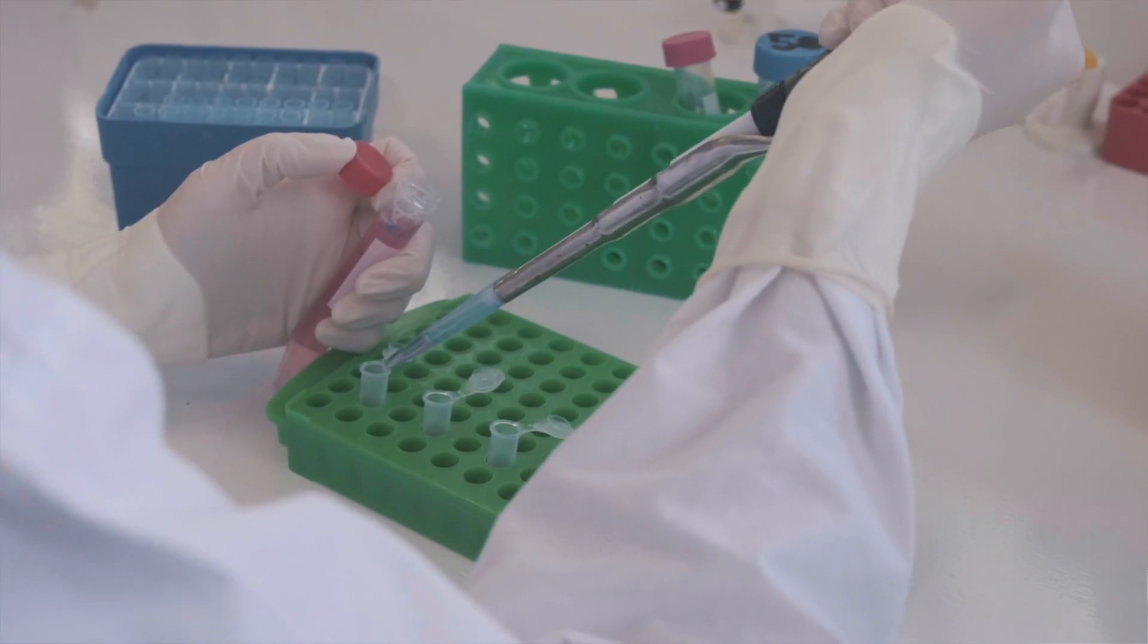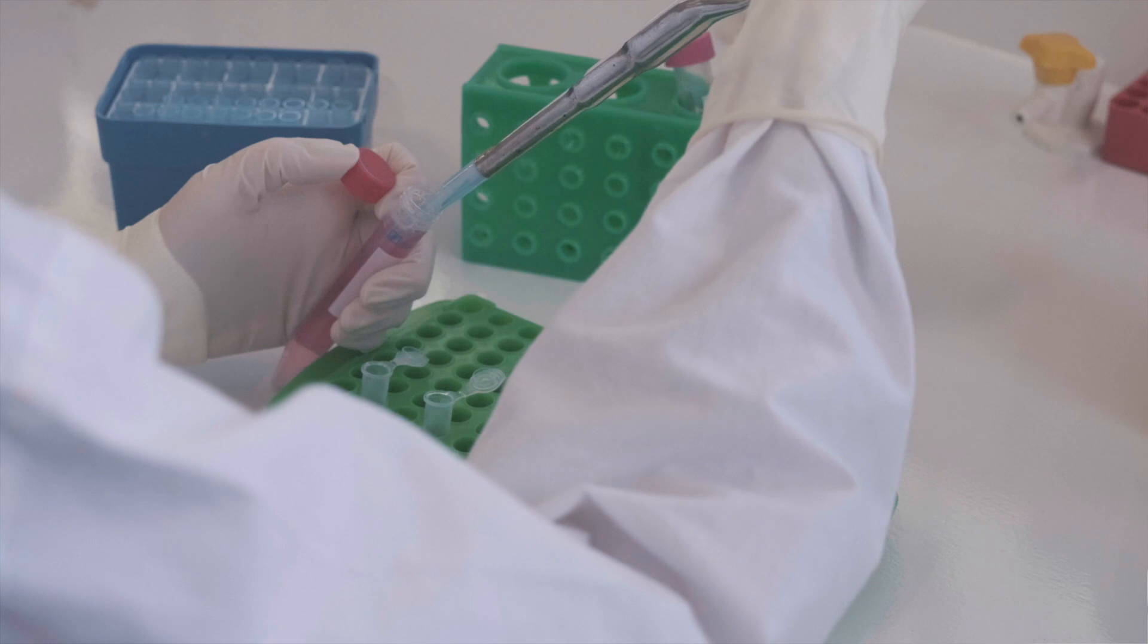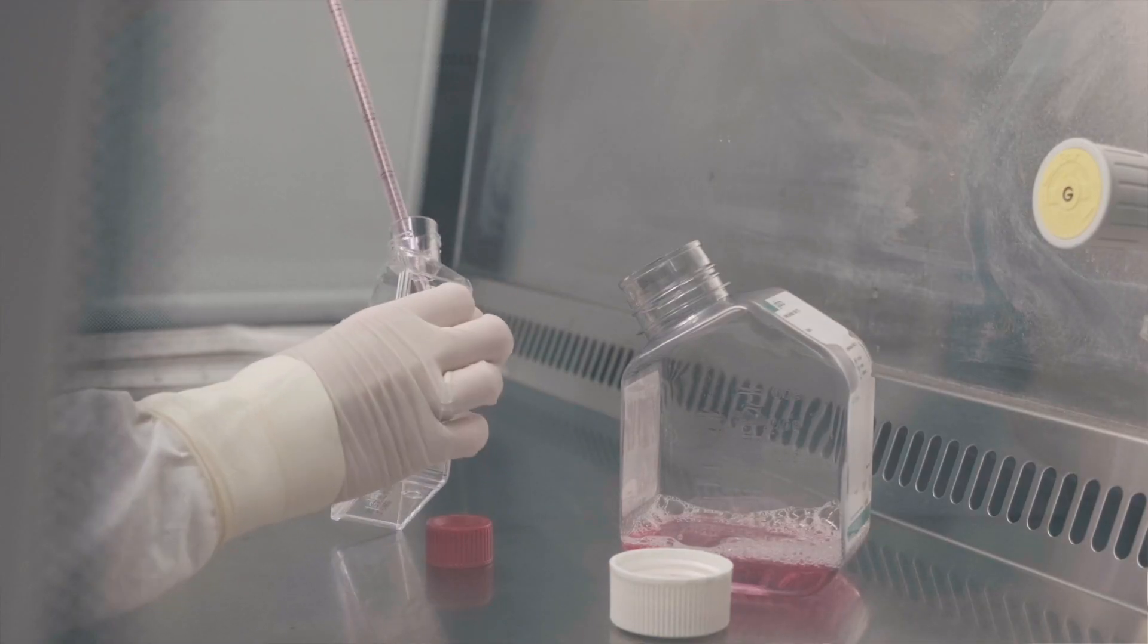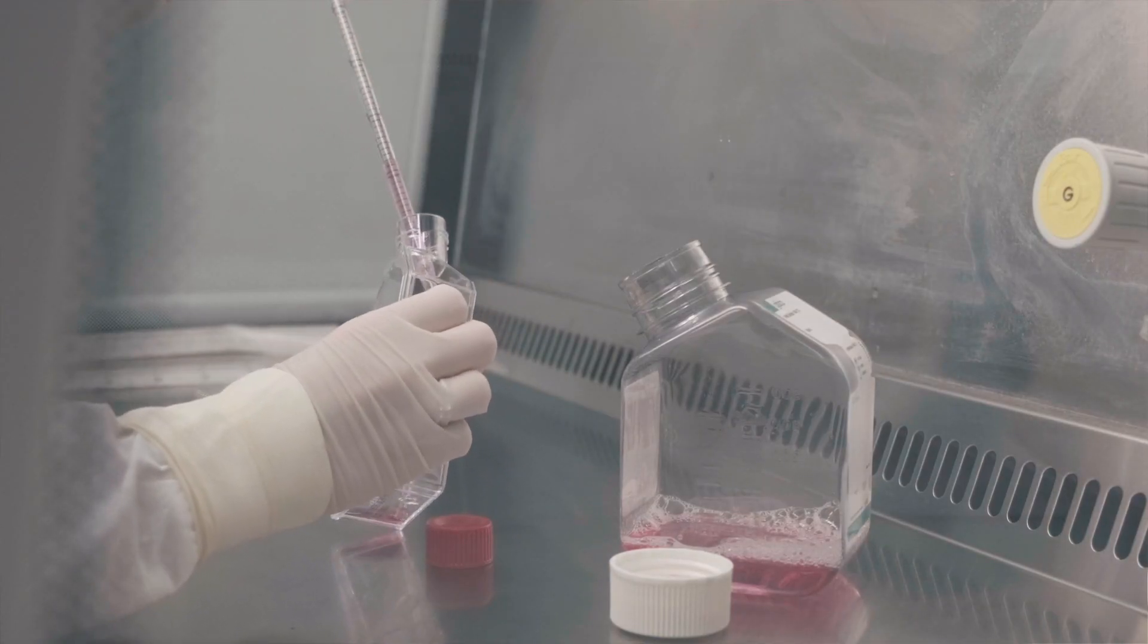Within biological organisms, molecular concentrations of proteins and chemicals can be very low. Scientists must dilute out their samples before exposing them to cells, and serial dilution, the stepwise dilution of a sample in solution, is the quickest way of doing this.